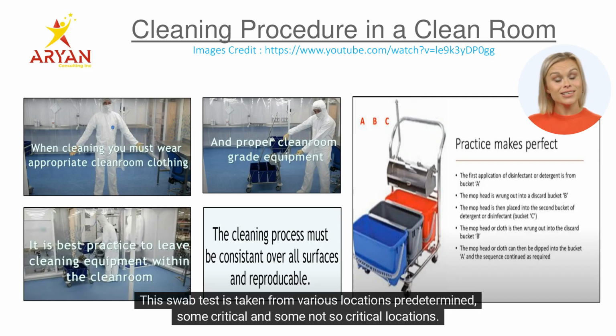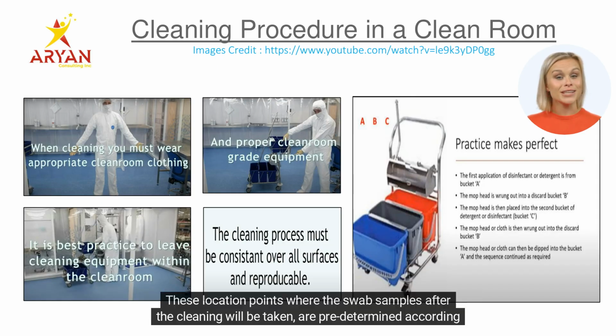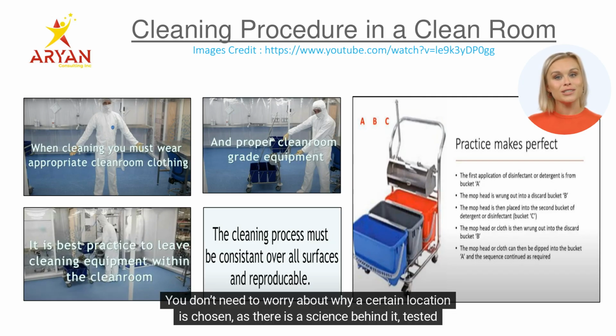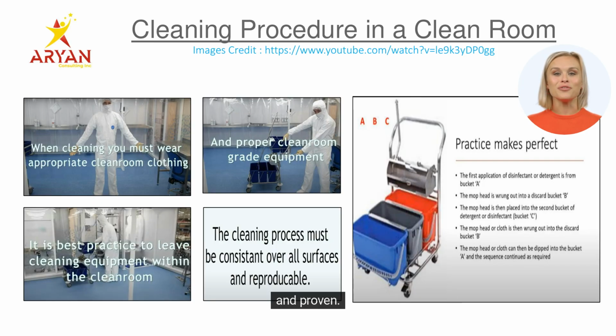This swab test is taken from various predetermined locations, some critical and some not so critical. These location points where the swab samples are taken after the cleaning are predetermined according to FDA regulations and are set according to the size or layout of a cleanroom. You don't need to worry about why a certain location is chosen, as there is a science behind it, tested and proven. You just follow the procedure.